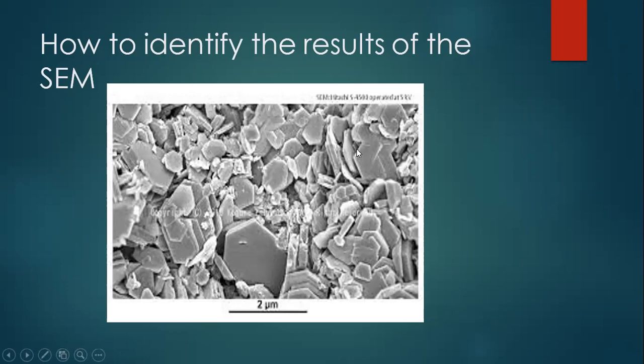What I also want to say is that in order to know the shape of the crystals inside the microscope, you need a reference book for the shapes of all the crystals under the microscope. After that, you take this sample, put it under the microscope, and study it to see which minerals you are looking for. The scanning electron microscope can also be a very, very important instrument for geologists, for geochemists, and for industrial geologists, in order to know which fabric they are dealing with.